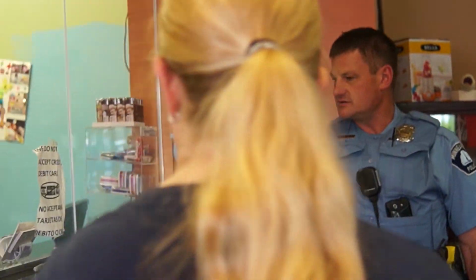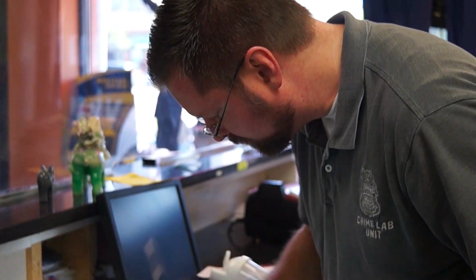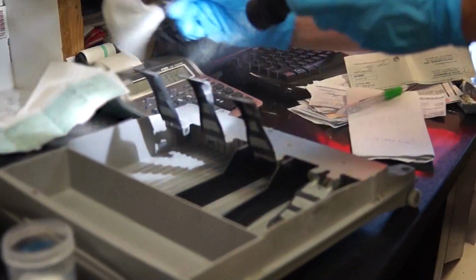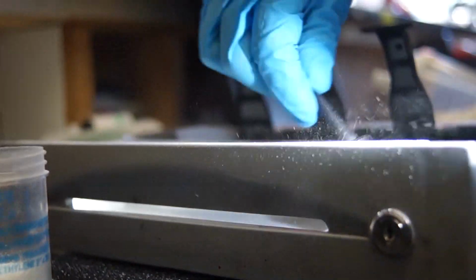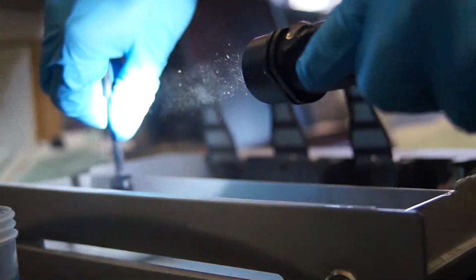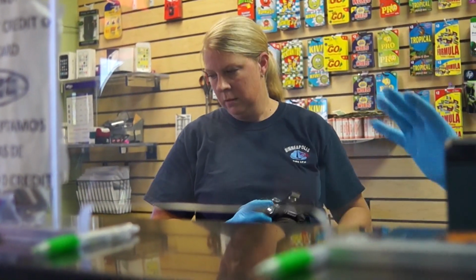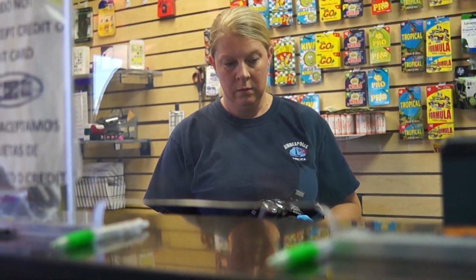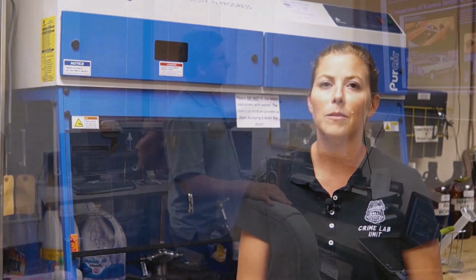The thing they like about the job is finding evidence, finding clues, helping those investigators where they were stuck before. So going to a crime scene and developing a fingerprint, and we come back and we run it through the system, and we are able to give them a name of someone that they didn't have before. Those breaks in the cases, or even cases where they have eyewitnesses or whatnot, but we're able to help them solidify that case. I think that for most people, that's the fun part about this job. We're helping them solve these cases for the citizens of Minneapolis.